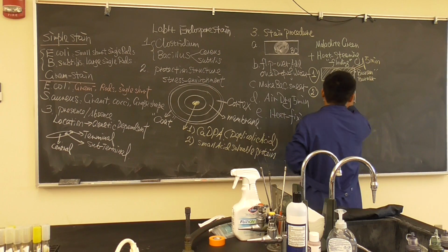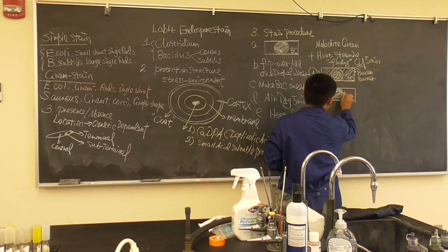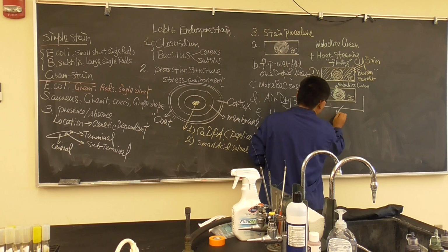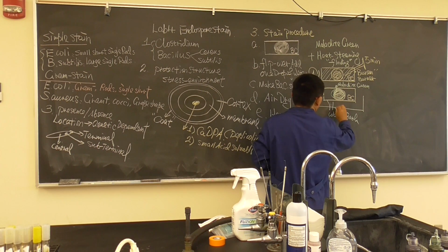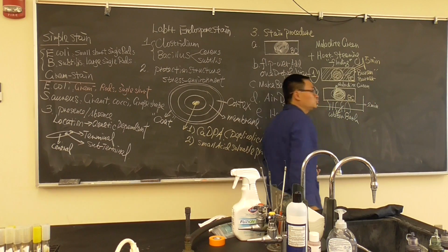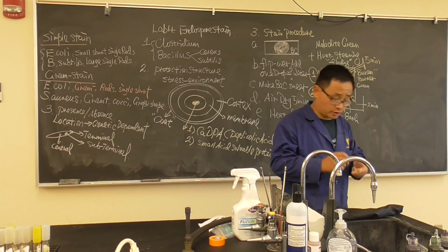Same thing, there's a glass slide right here. You make a smear. We will use a water bath to heat it. So you only need to cover the malachite green right in the middle. So this will be adding malachite green. And then we're going to put it into a water bath. You see the water bath is already turned on, and the steam is coming from the bottom. And this will steam for, let's say we do 2 minutes. Sometimes we do 1 minute. Let's do 2 minutes. Let's steam a little bit strong, okay? Then hopefully it will be penetrated.